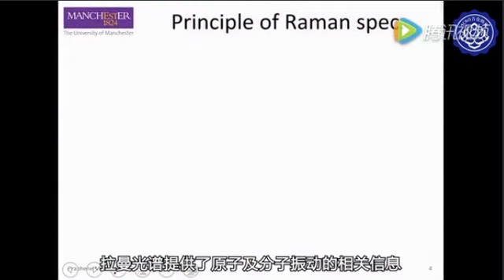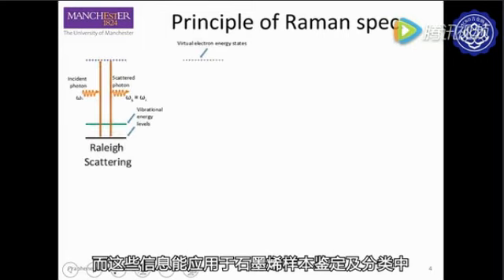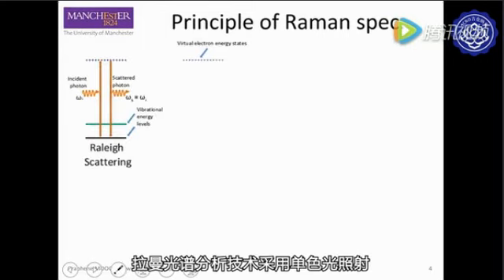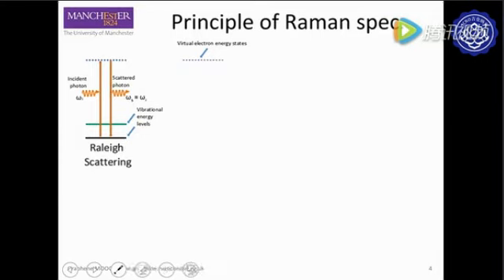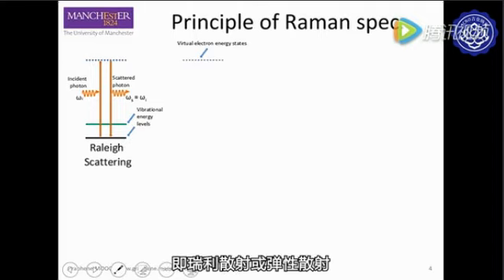Raman spectroscopy provides information about the atomic and molecular vibrations that can be used for sample identification and characterization. The technique involves shining a monochromatic light source such as a laser on a sample and detecting the scattered light. The majority of scattered light photons are of the same frequency as the excitation photon. This is known as Rayleigh or elastic scattering, which does not change the energy of the photon upon scattering.